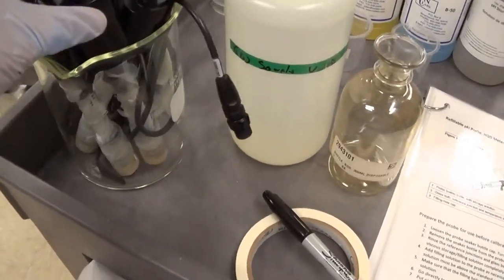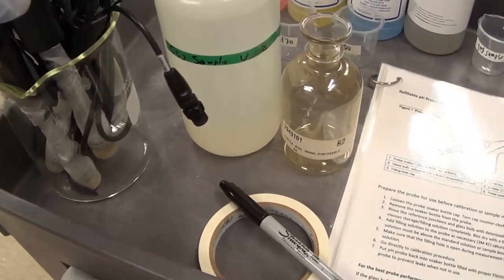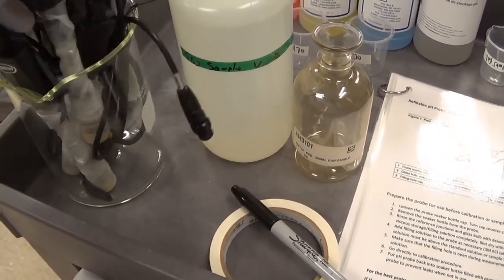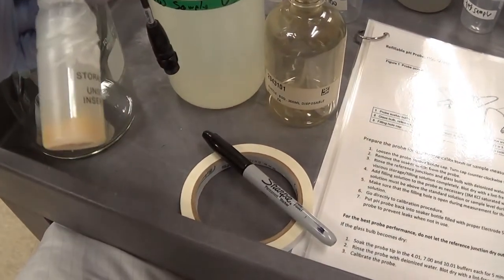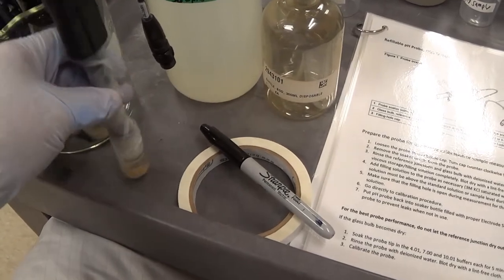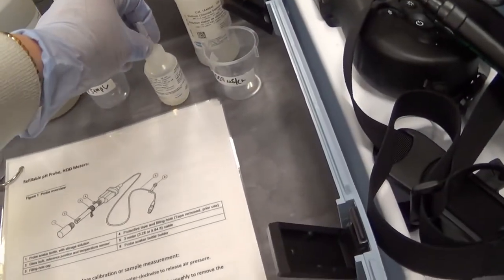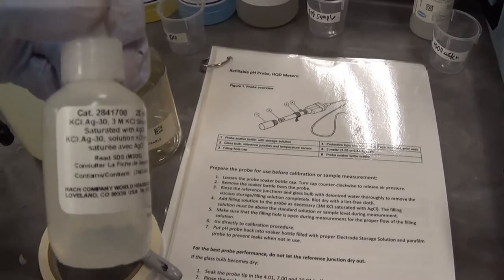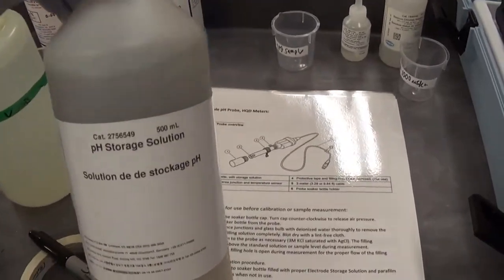The kits also come with pH probes, but I've been keeping them out separately because sometimes they're not sealed very well and leak all over. Just like the pH probes that we use on our desktop models, they should be kept moist. They have different fill solution and pH storage solution than our other pH probes.